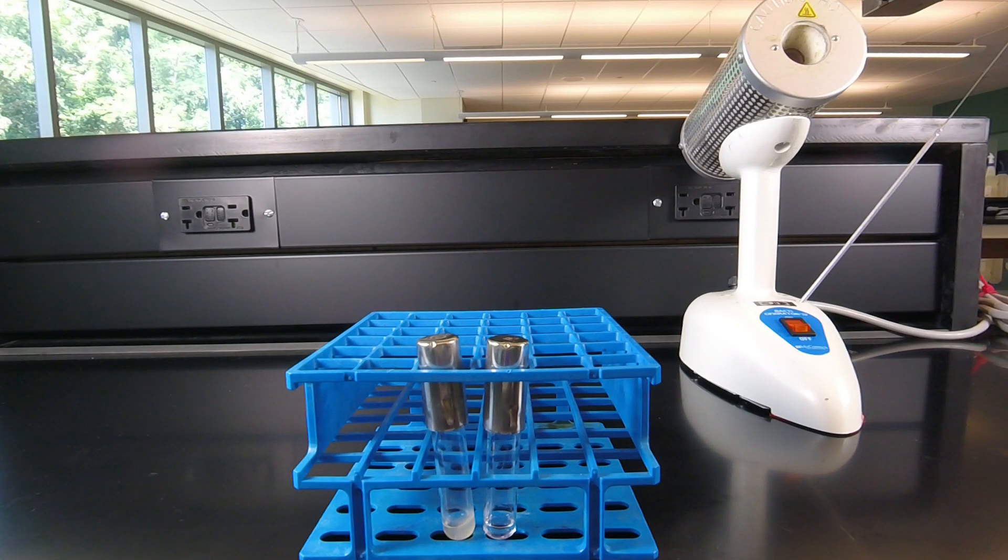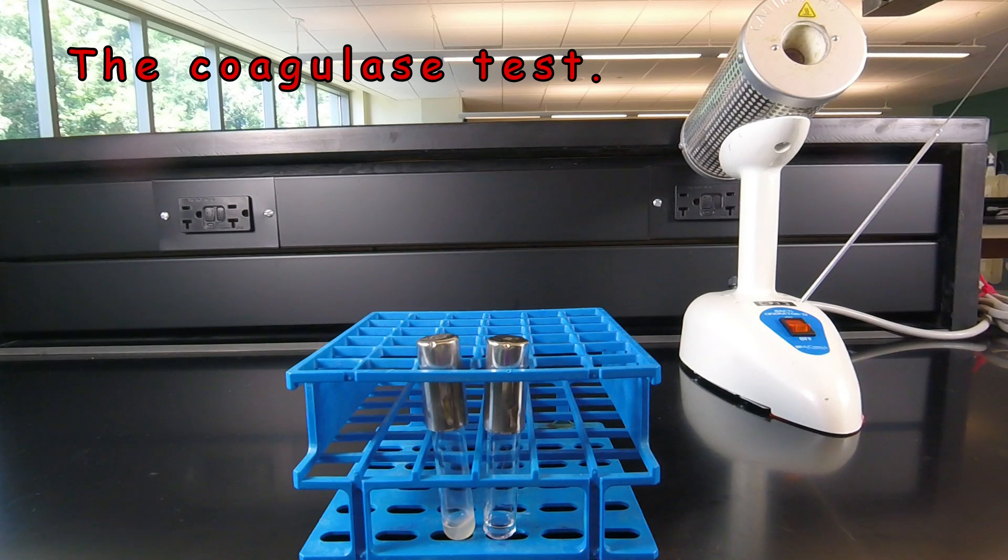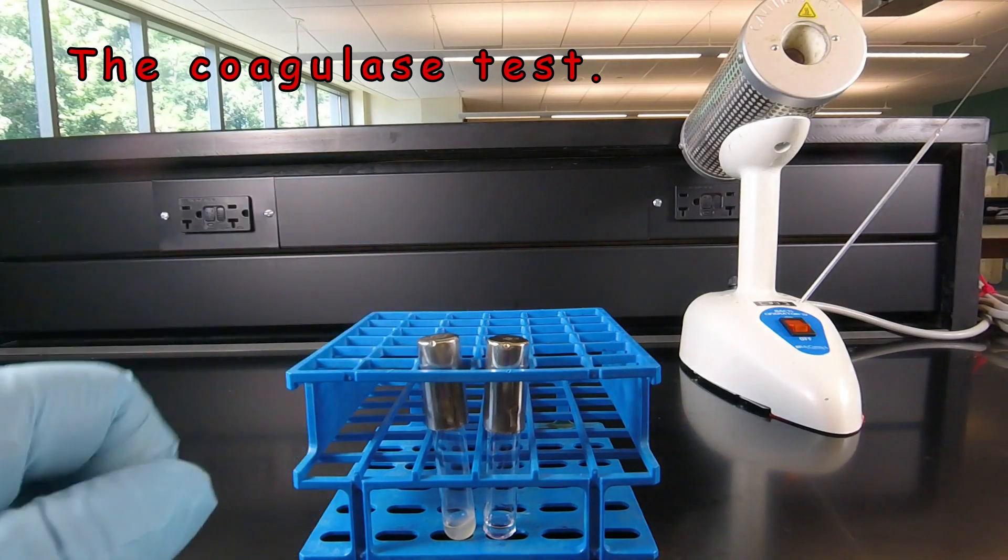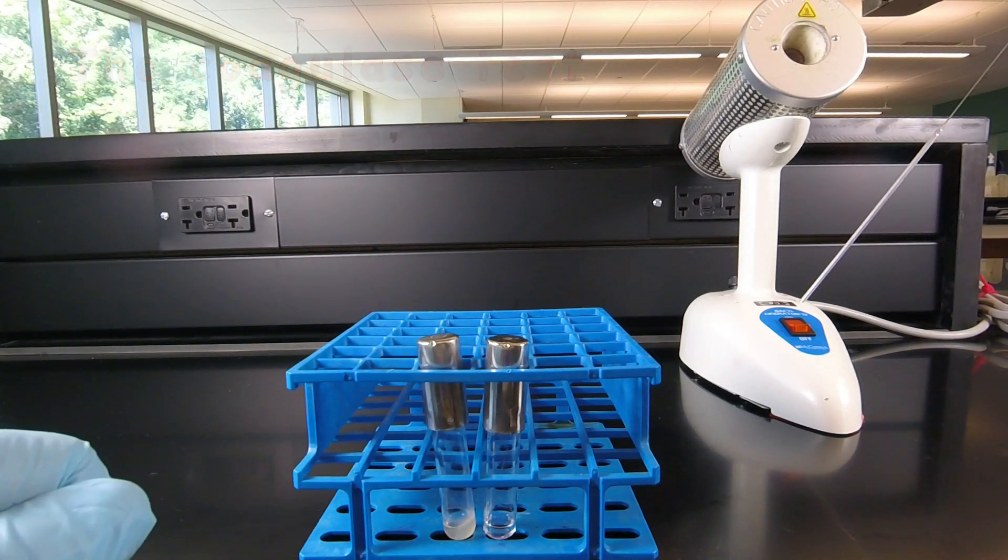One of the most useful tests for differentiating Staphylococcus aureus from other species of Staphylococcus is the coagulase test. The coagulase test looks for the enzyme coagulase.